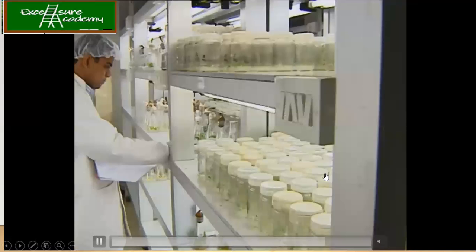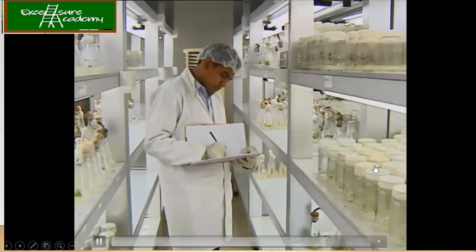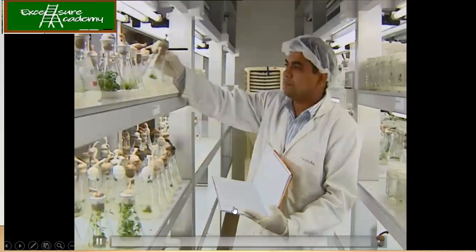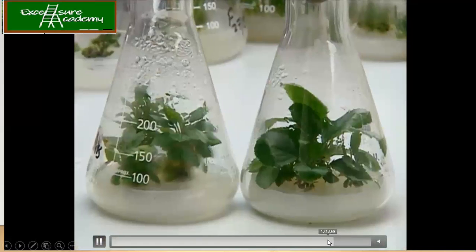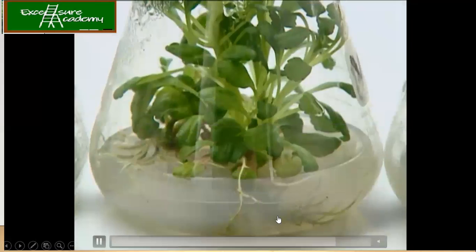You can see that over here the entire room has a controlled environment. You can have these bottles or conical flasks, or you can have boiling tubes also. Every time you need to check the growth of the plantlets. Maybe in 24 hours or 48 hours, at least once you have to come and see how beautiful the small plantlets are that have grown from one single small piece of the stem. Here you can see the roots are also there.